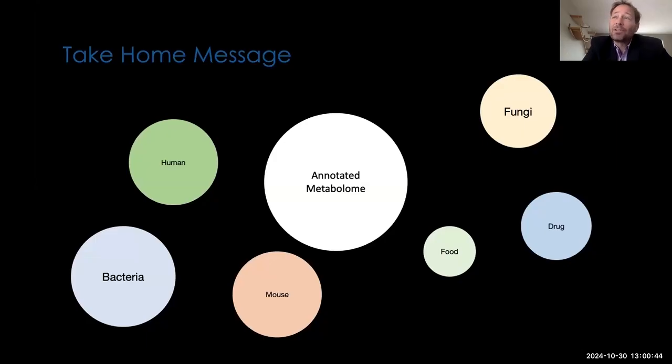And we've seen this also, that if you take a Hispanic community versus a non-Hispanic community, and you don't have reference data from that Hispanic community, you don't get as many food matches than if you do include the reference data from the Hispanic community. So there's real value of getting more. The more data you have, essentially, the better it will be.